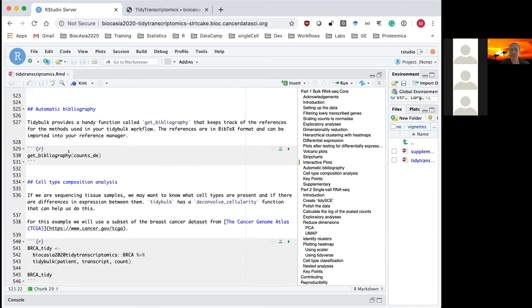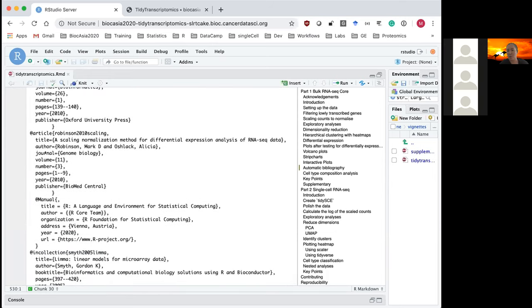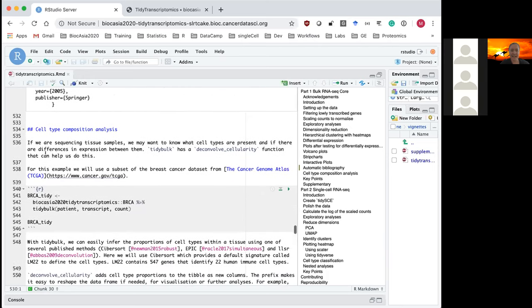A nice feature tidybulk provides is the get_bibliography function — it keeps track of the methods you are using in your tidybulk workflow and provides them so you can use them in publications. As well as differential expression analysis with limma, edgeR, and DESeq2 wrapped in tidybulk, tidybulk also provides methods for cell type composition analysis — detecting which cell types are present in your bulk RNA sequencing, for example which immune cells are present. This is commonly done with cancer cell samples.